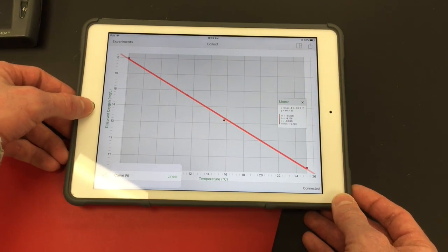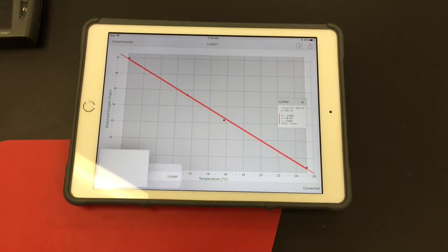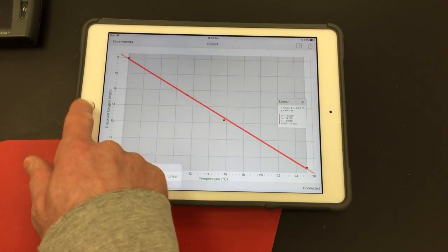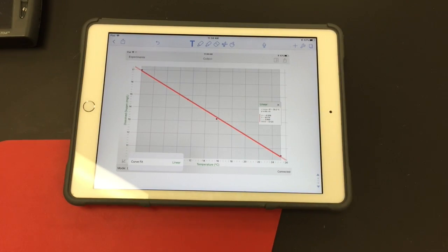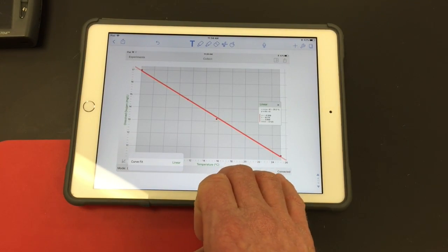So I'm going to screenshot this. Then I'm going to add it to the write-up. Okay, so I've added the screenshot to my write-up.